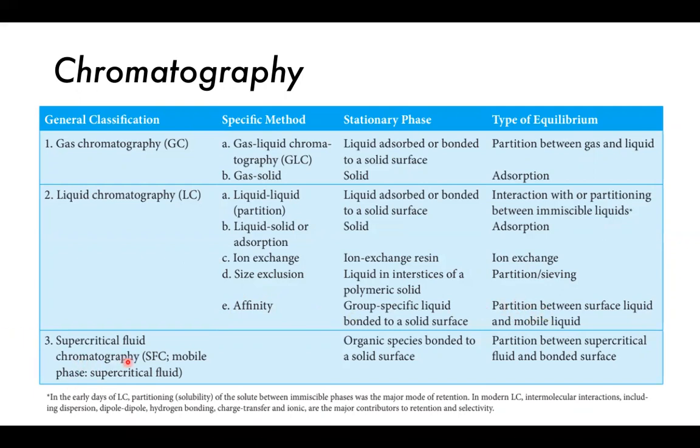Then supercritical fluid chromatography is another type of chromatography. It's not quite as common because at the end of the day, it's rather expensive to maintain, and so it's not really that industrially viable just yet. So organic species here are bonded to a solid surface. And the partition here is between the supercritical fluid and the bonded surface. So whether or not they want to be deposited on that surface of the stationary phase, or whether or not they want to be in the supercritical fluid.